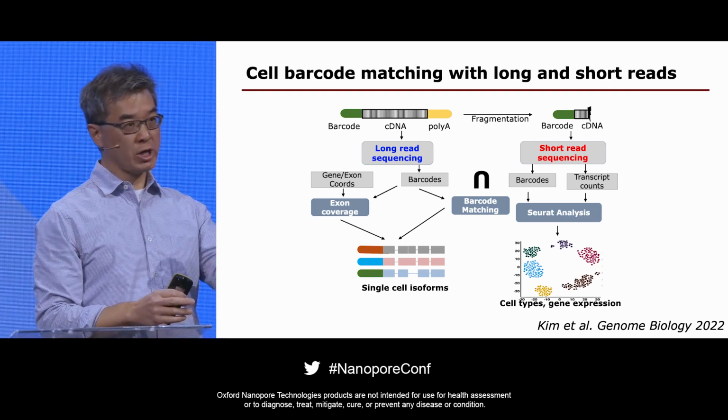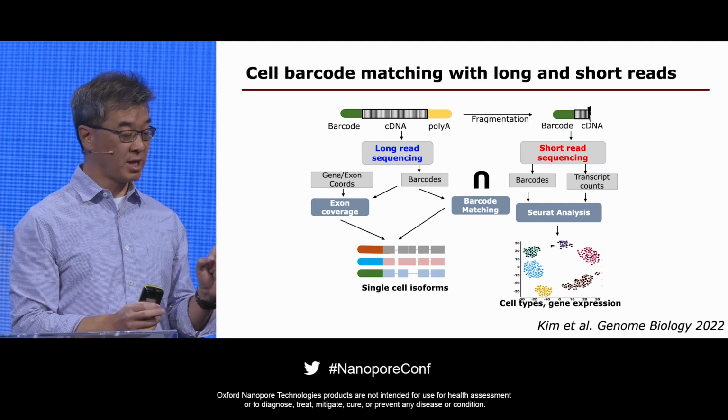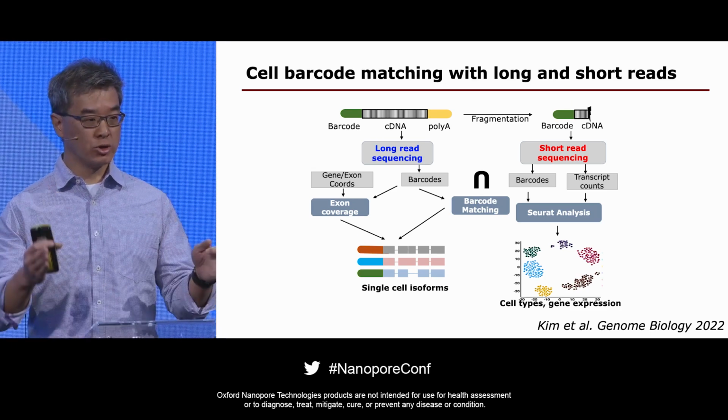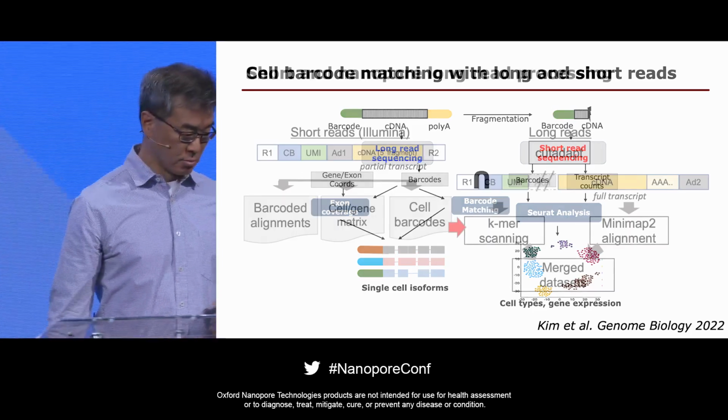And from the enumeration using the short reads, you can define gene expression features per given cell. But then taking advantage of the nanopore sequencing and the extended long reads across the transcript, you can drill down into new features that previously have not really been leveraged.